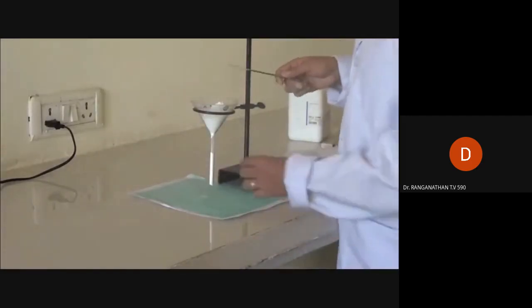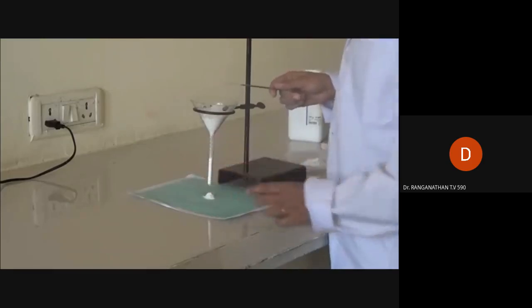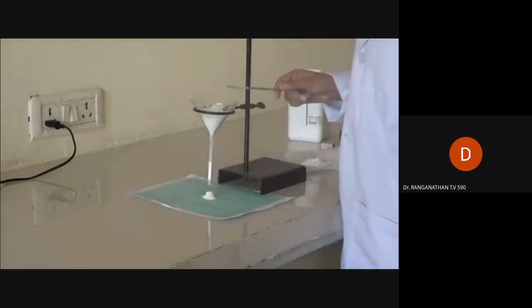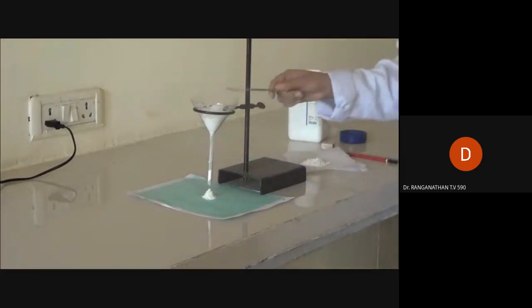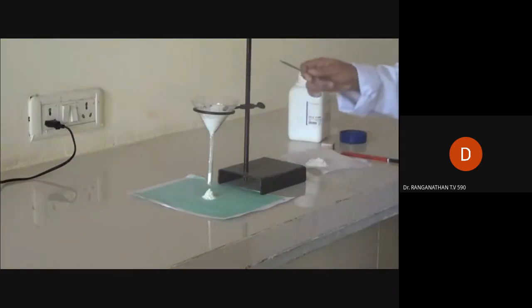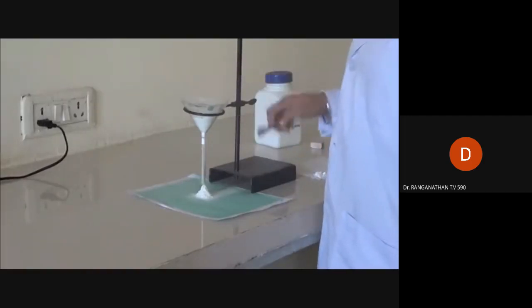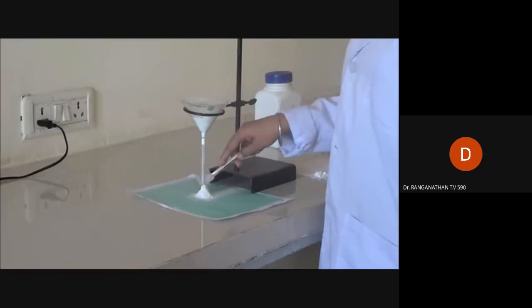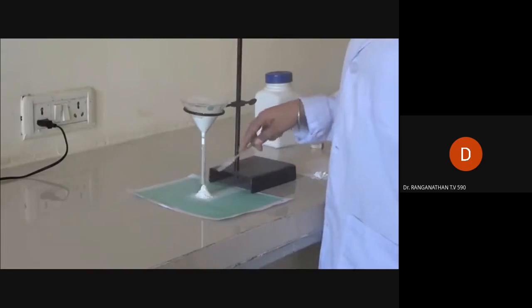By lightly tapping the funnel, the powder will pass through the funnel and form a heap of powder. After passing through the funnel, the powder will form a pile at the bottom, and we have to pass the powder until the tip of the pile touches the end of the funnel.